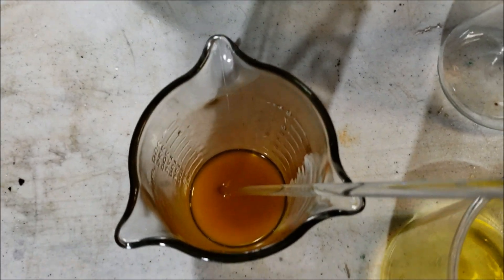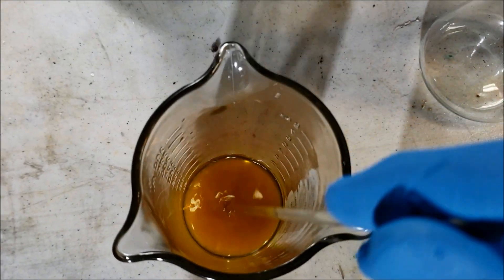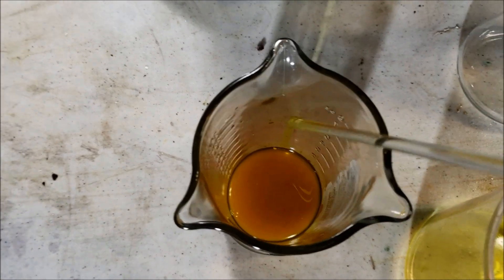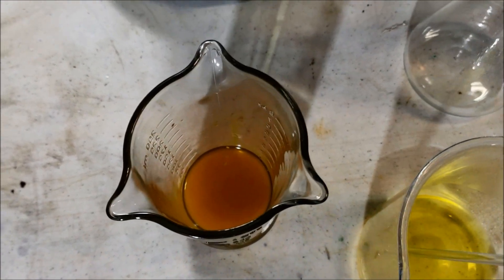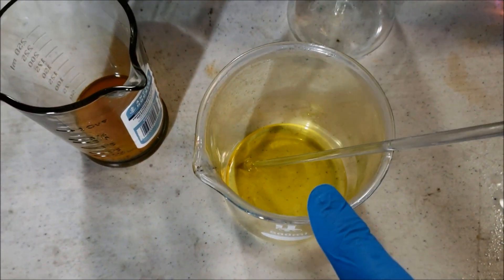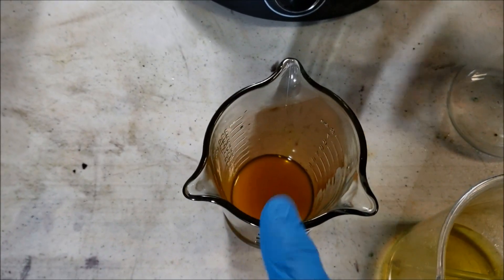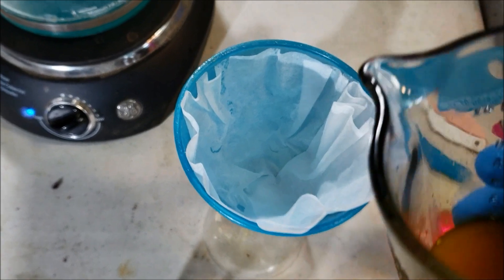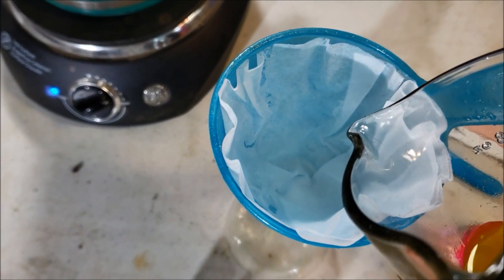This seems to be very saturated - I think there's still some gold in there. I'm going to go ahead and filter it through, and then I made up another little batch of aqua regia. I'll dump those chunks back in there and we'll try it again.